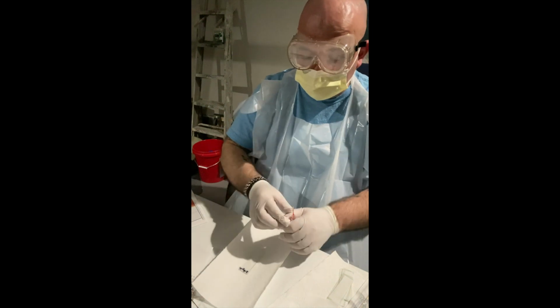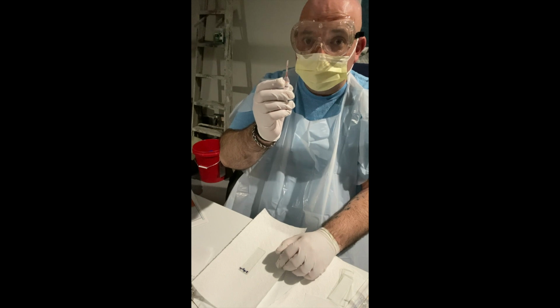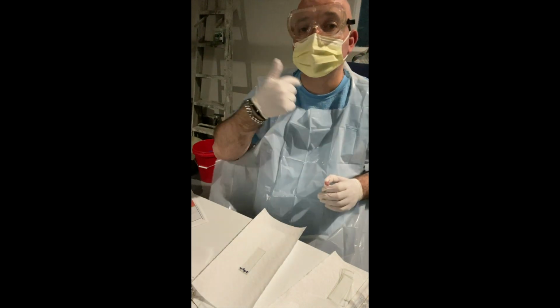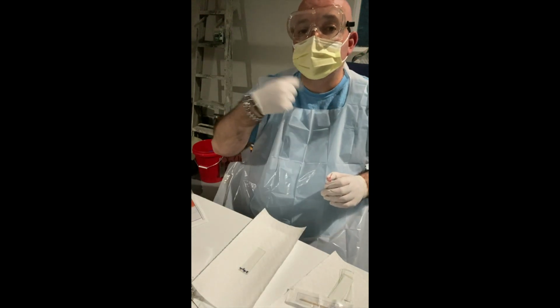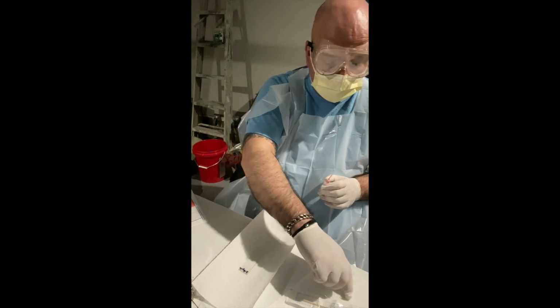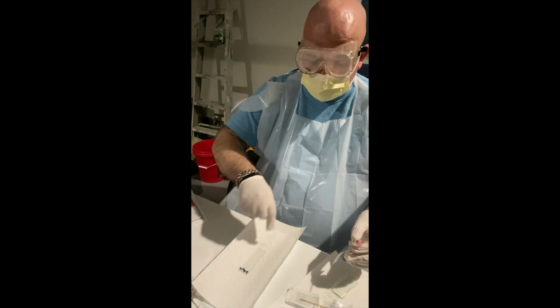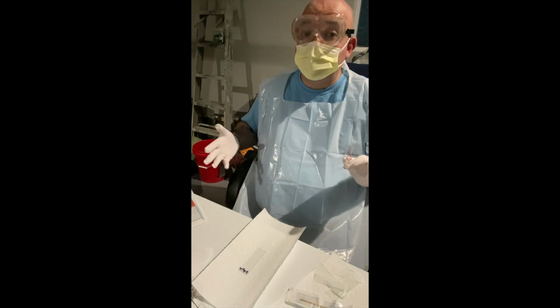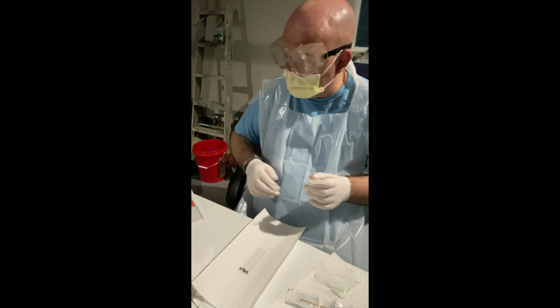So what I'm going to do here is place a sample of the Congo red on the slide. Then I'm going to use a sterile swab and again collect a sample from my teeth and gums, agitate it in the Congo red, and then using a second slide, I'm going to spread the stain across the slide. Then it will have to dry completely before I can view it under a microscope.